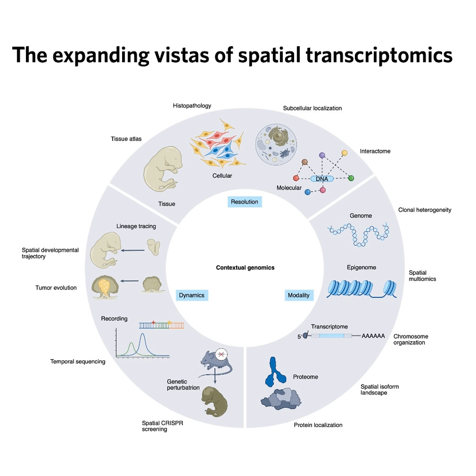Today, we are taking a massive leap forward into a technology that is fundamentally rewriting how we understand anatomy. Spatial transcriptomics, or ST. Yeah, it really is. This is the breakthrough that's starting to unlock the deep secrets of tissue biology. And for decades, biological researchers faced this really cruel trade-off, didn't they? They absolutely did. You could either measure everything molecularly, or you could measure precisely where a few things were located, but you really couldn't do both at the same time.